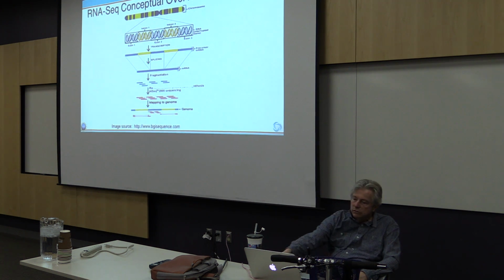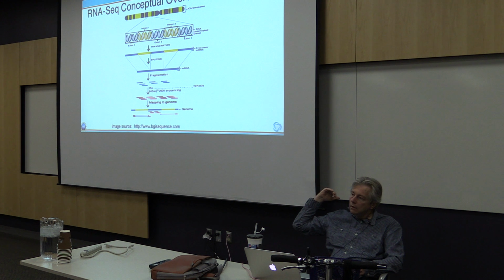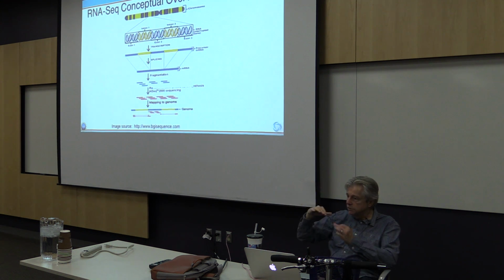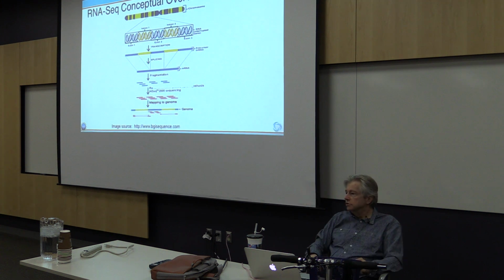and the applications, when they're good for use for RNA-seq, will often recognize, okay, this piece that I'm looking at bridges across, and so we're looking at not only information on two exons, we're looking at the actual junction.